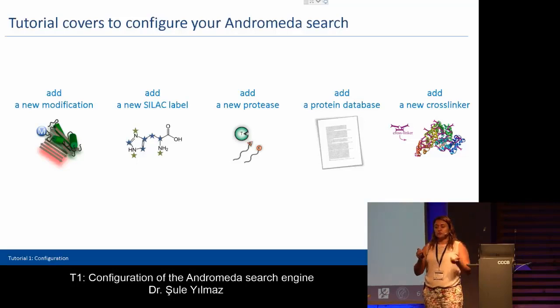Most of you, I noticed, were here for Pavel's talk. Pavel already showed you where it was, so we can quickly go through it and remember where we can add the protein database. And the last one, just quickly showing where in the future you will find the cross-linker.